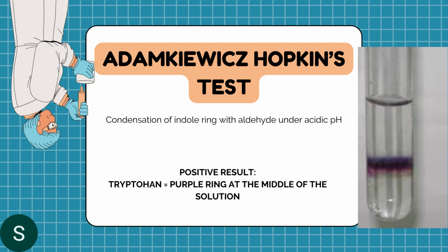Again, what you have to remember here is that the indole group of tryptophan reacts with your glyoxylic acid in the presence of H2SO4. Again, your positive result for tryptophan is a purple ring at the middle of the solution.